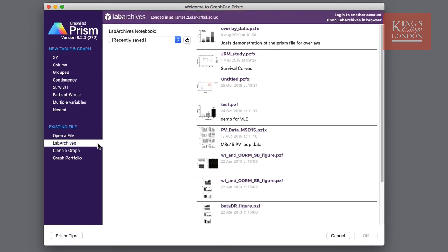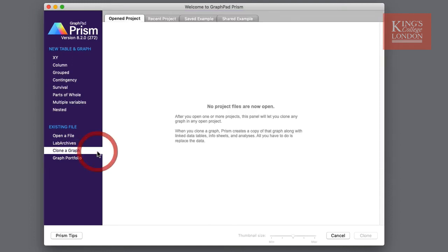A particularly useful function in Prism is the ability to clone a graph for a previously undertaken study. By clicking on clone graph Prism will open up a window that shows you any currently open projects. Since I'm opening Prism here for the first time I don't have any opened projects but I have four tabs to choose from.